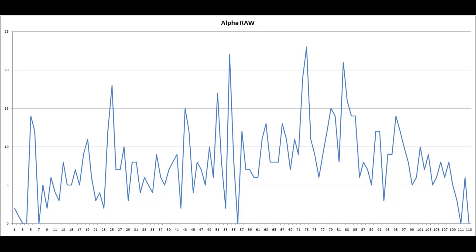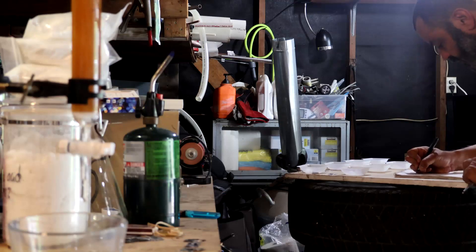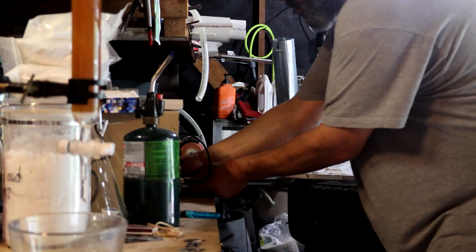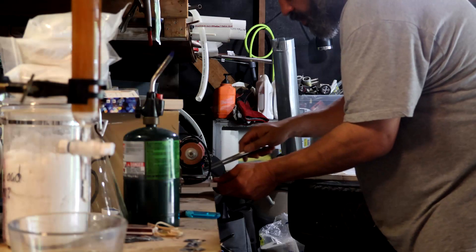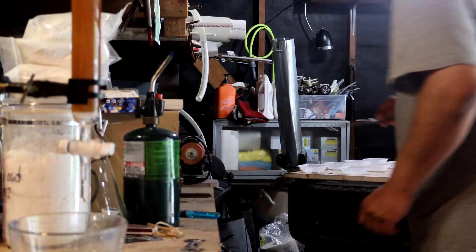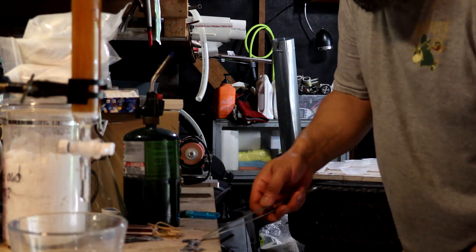But determination paid off and here are the results. This is the raw data with some fairly obvious peaks. To see them better, I subtracted the background. We cannot expect to see thousands of counts from a solution, even a concentrated one. The only way to reduce the background enough is to consider the standard deviation. This is a numbers game, and the statistical deviation can help increase the signal-to-noise ratio by eliminating all the numbers statistically close to background.